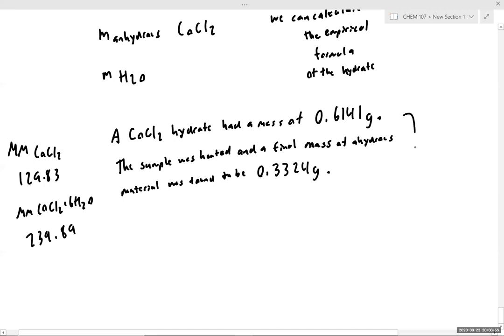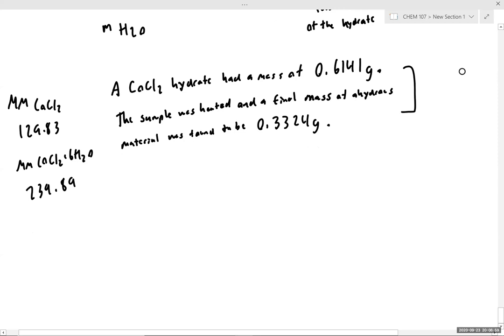So from this information, we can calculate the empirical formula of our hydrate.